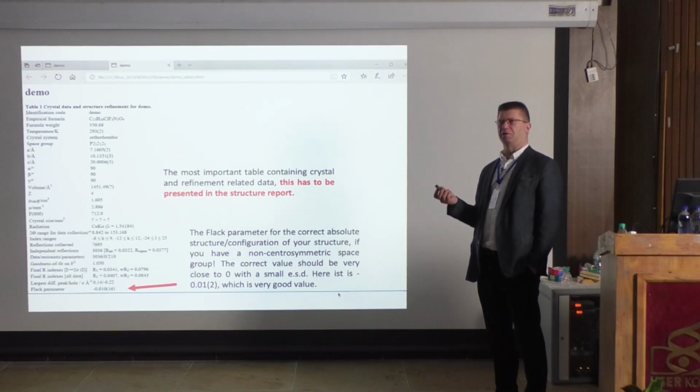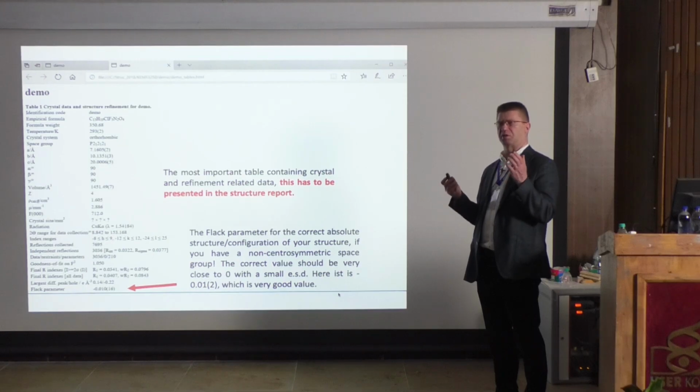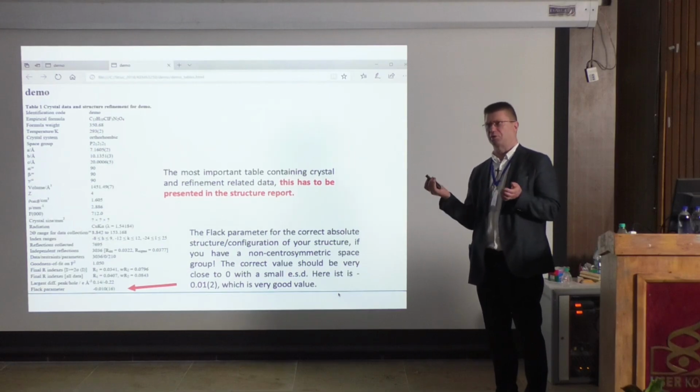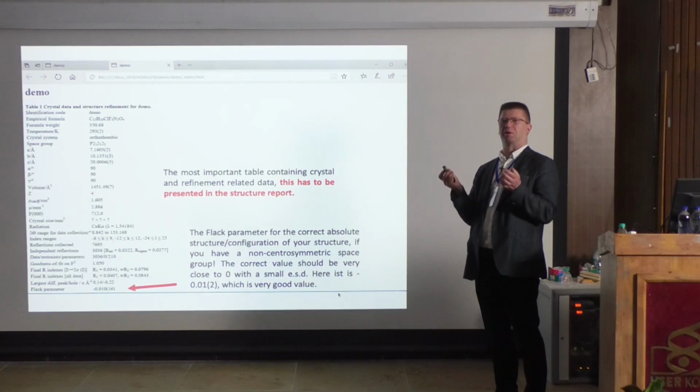And the optical purity means that it has 2 options. If it crystallizes in a space group which is centrosymmetric, meaning that there's a mirror image of it, the same as left and right hand, then there has to be 50-50, left hand, right hand. That's absolutely okay. It's very common, actually. And that's racemic.